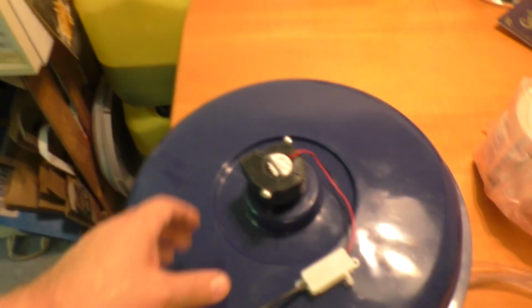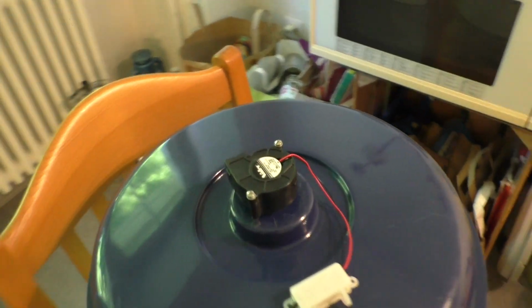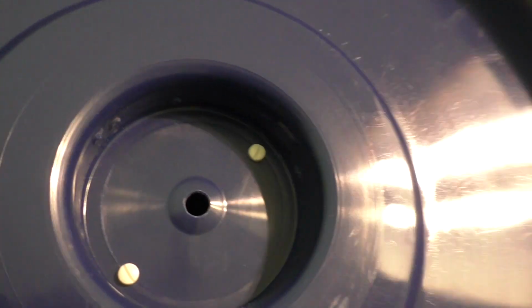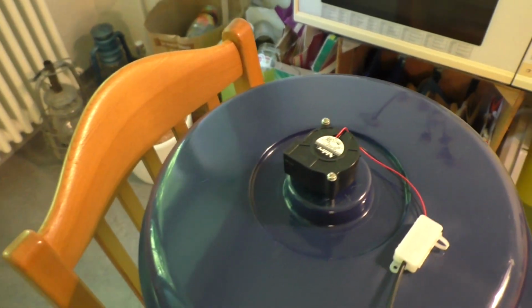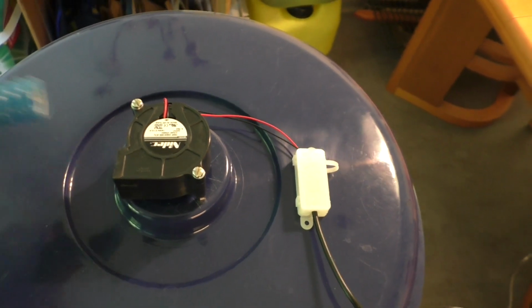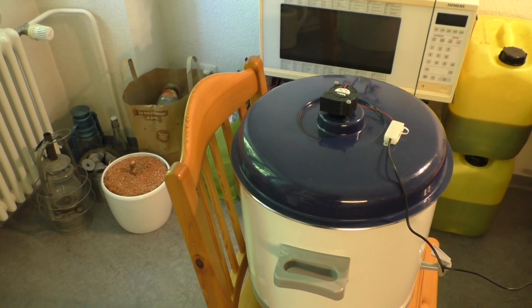I don't want to cook because, well, I fear there are some fumes escaping that are not very healthy. Well, speaking about fumes, I have this cover here, and it has a little fan on the top, and underneath there is a hole. The idea is to collect all the fumes and vapors. At 50 degrees Celsius there shouldn't be too much. And then we vent that out by this hose that gets connected somehow to the fan, and then I will hang that out of the window. Yeah, that's the plan. Let's see if it works.